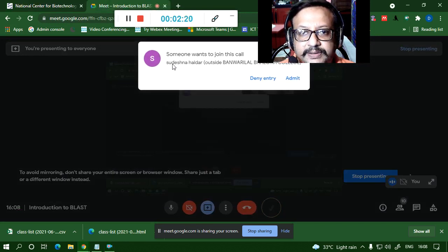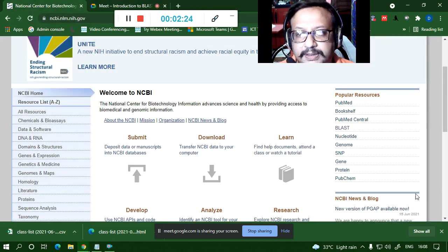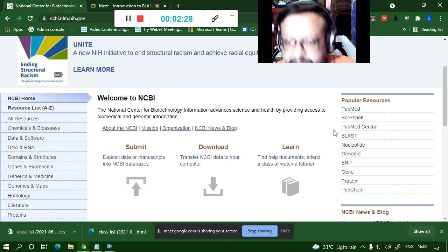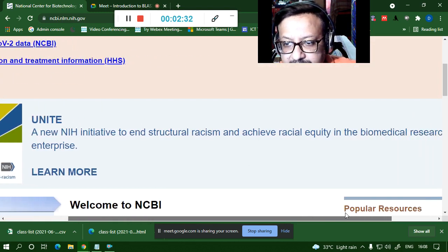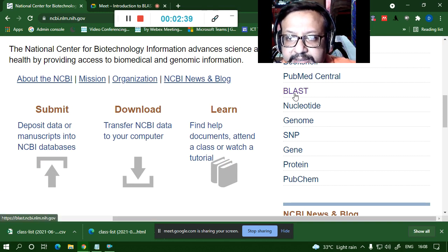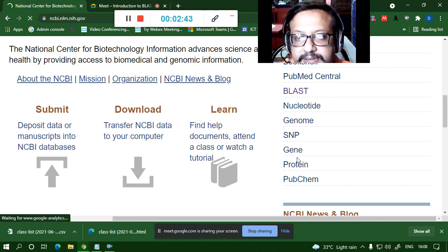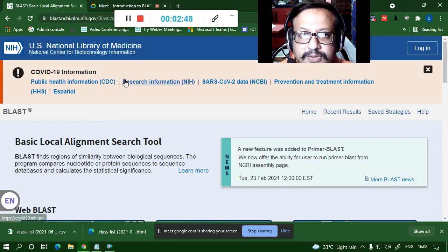On the right hand side, let me increase the size. You will find this region known as BLAST. This link, you have to open this. So the new site opens. This is the BLAST site.